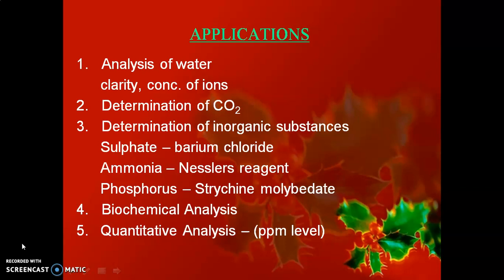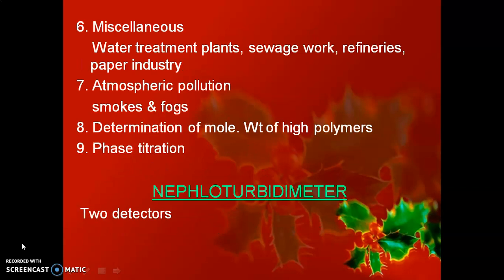In biochemical analysis also, this technique is very useful. For quantitative analysis, ppm level can be determined using this technique. Bacterial concentration can also be determined in biochemistry.